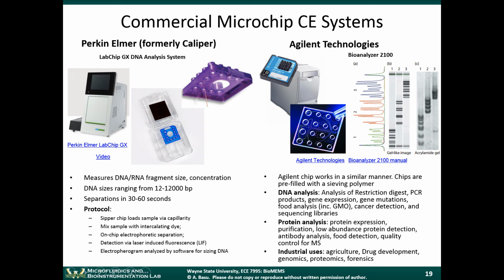In terms of protein analysis, you can measure the amount of proteins in a certain sample, protein expression, purifying proteins from samples. This can also be used for food if you want to find out how much protein or how much of a certain type of protein is in a food. You can use it for detecting antibodies too. Antibodies are molecules that attach to proteins, and they're important in your immune system.